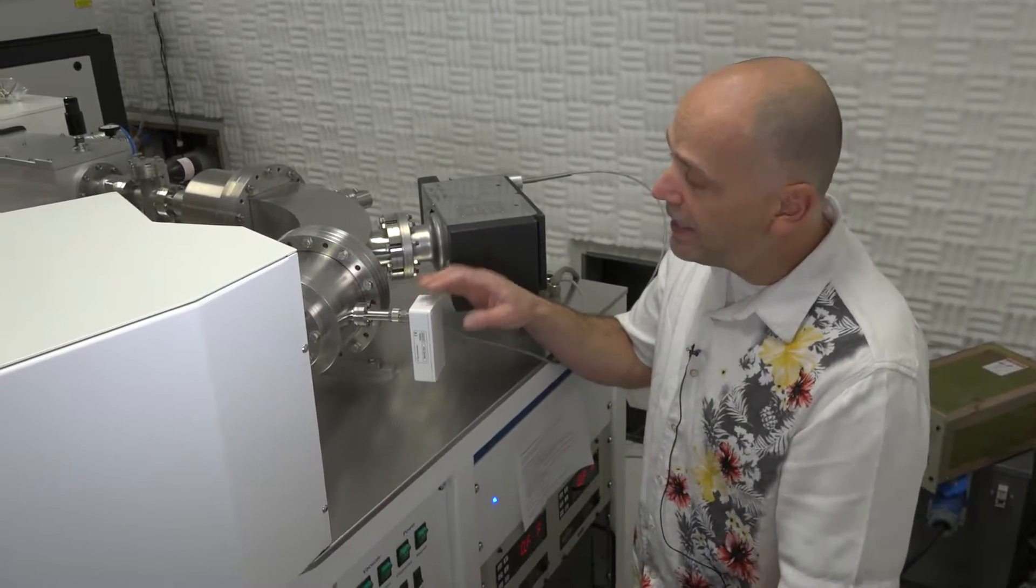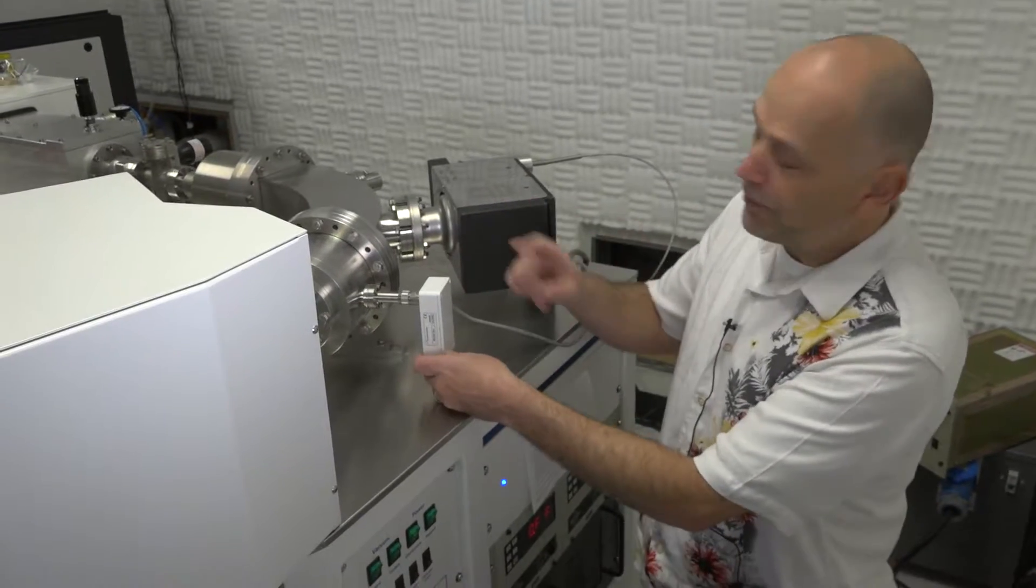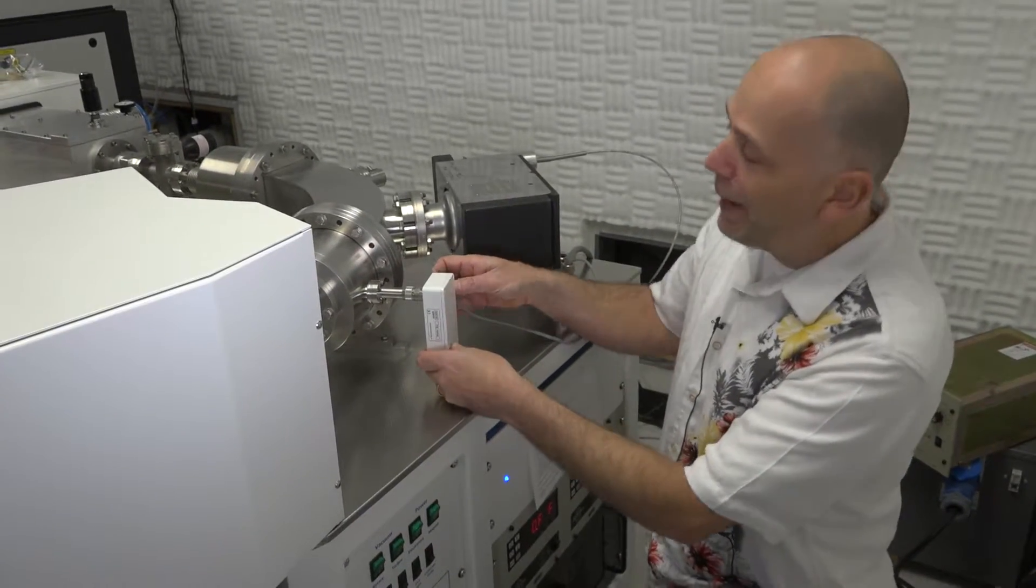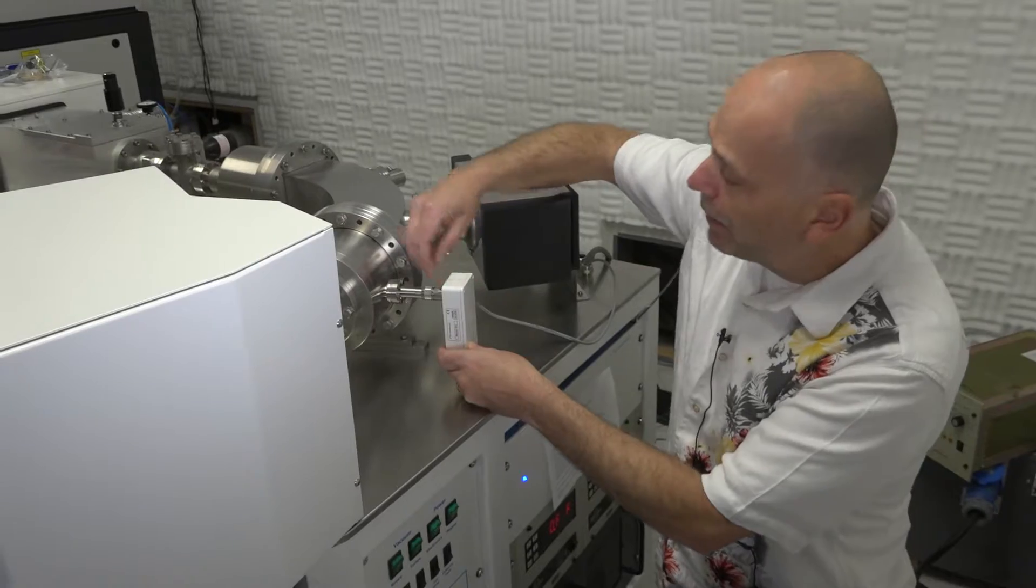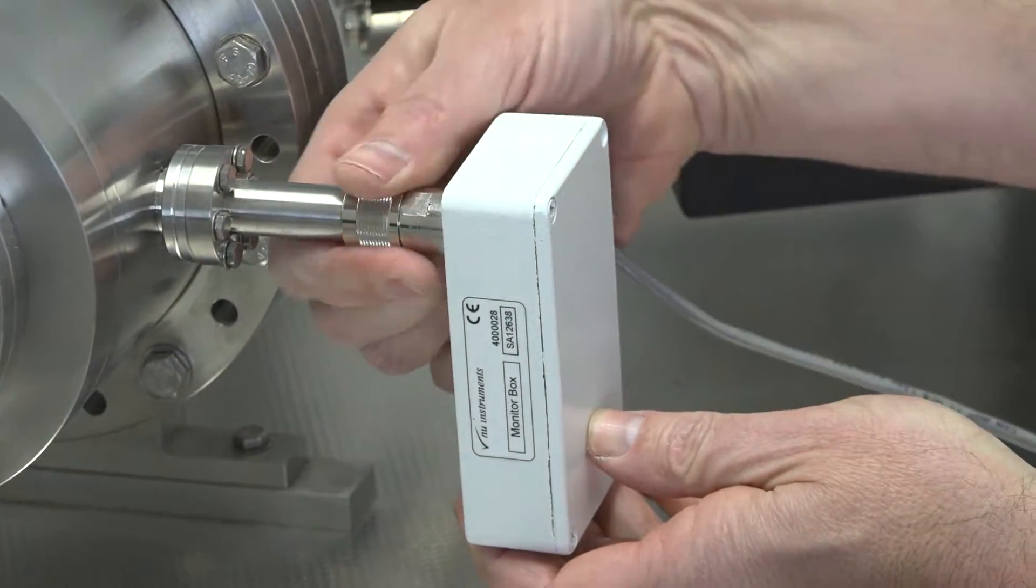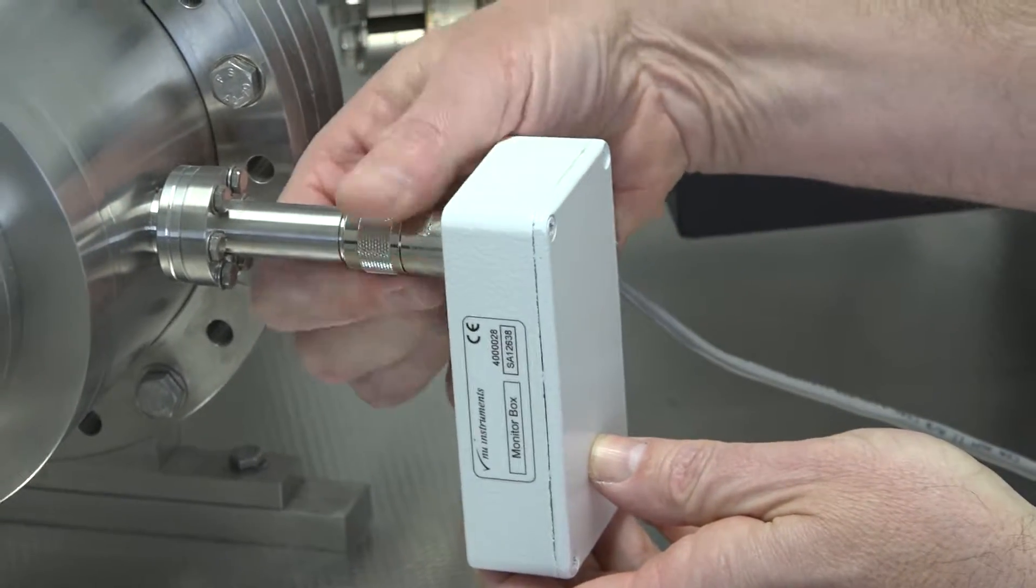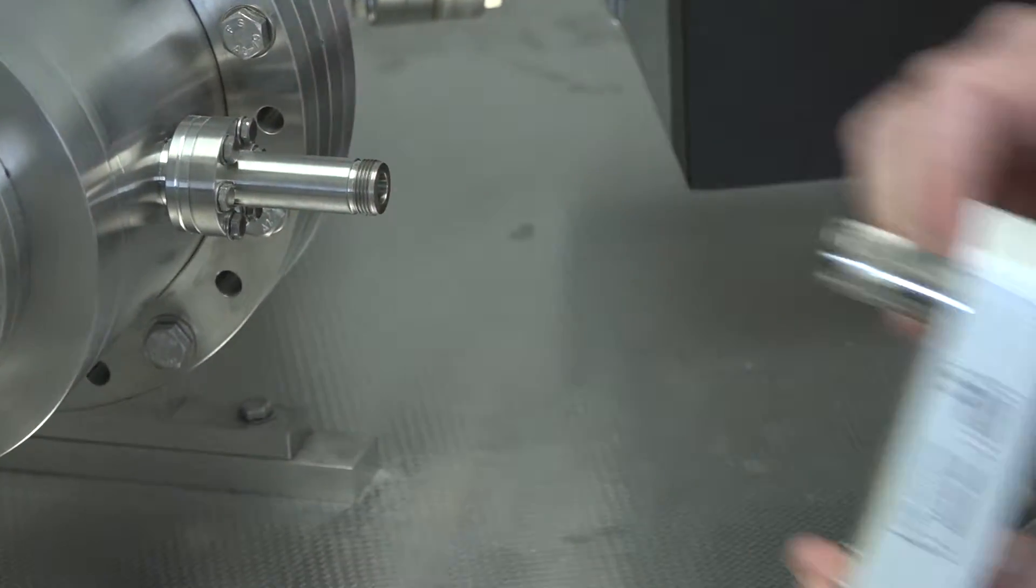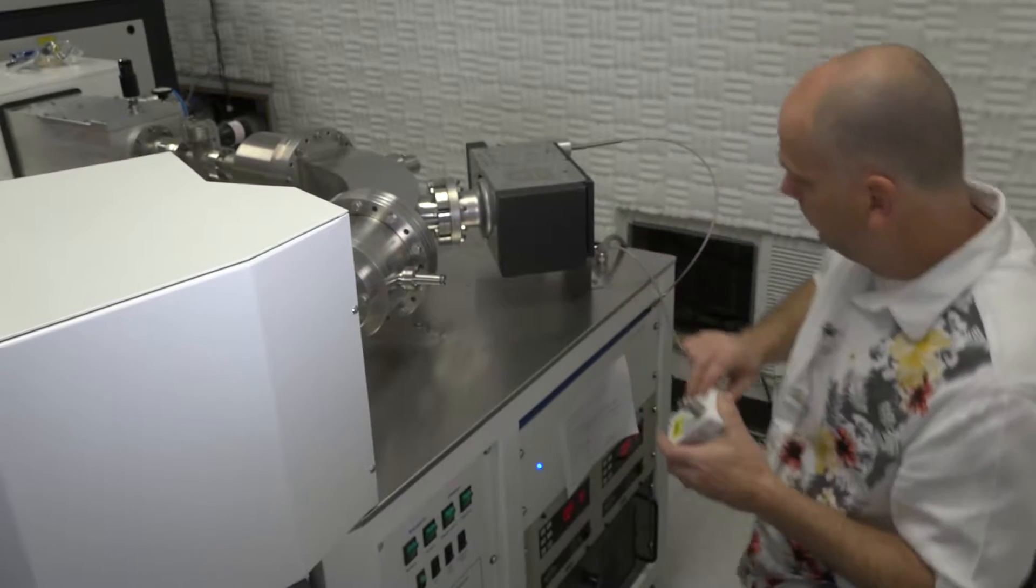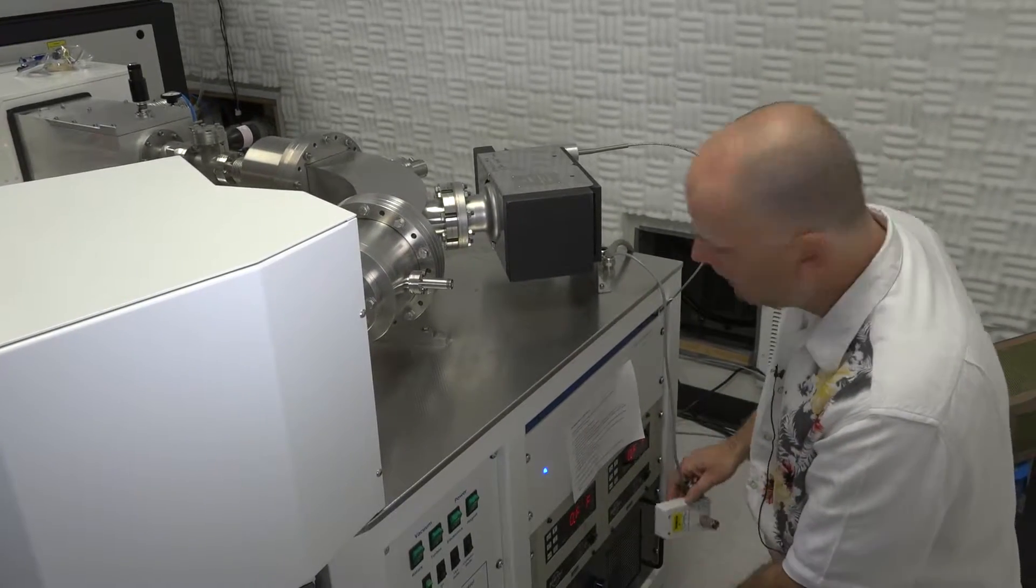The monitor box on the ESA needs to be removed. It's not sufficient to remove just the cable on the back. You actually have to remove the entire monitor box, unscrewing it in this manner. Pull it straight out and it comes right off. Just lay that along that side of the instrument.